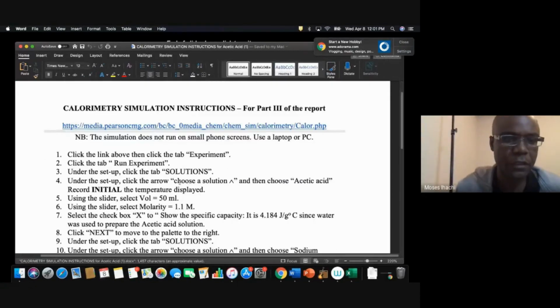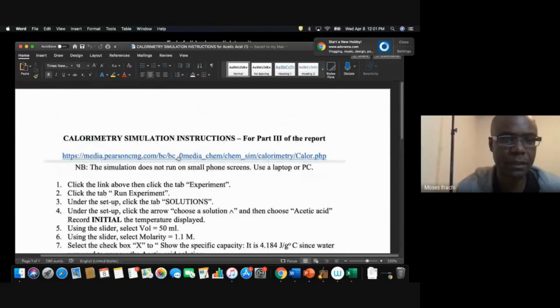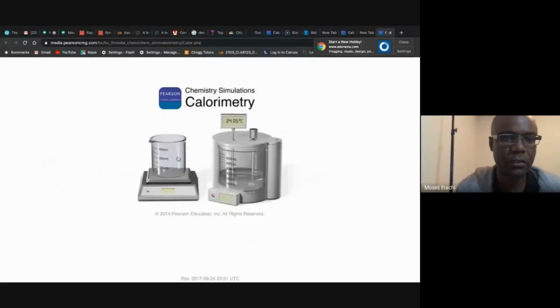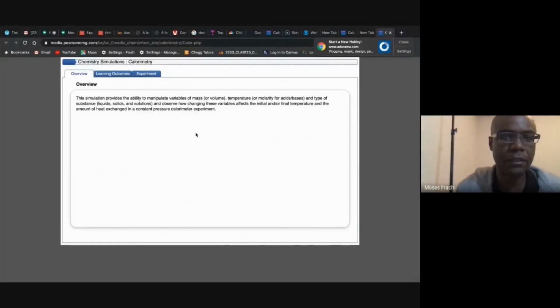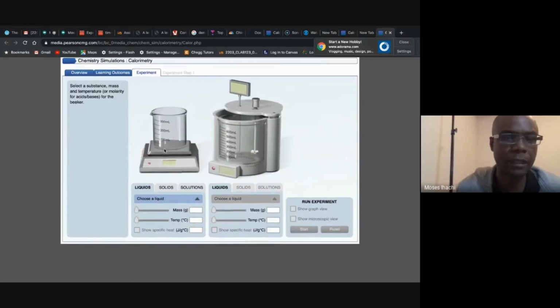So it gives you the steps to follow. Well, I typed up the steps. I know the steps to follow. So just click the link. It brings you here on an external website by Pearson. So experiment, click run experiment.